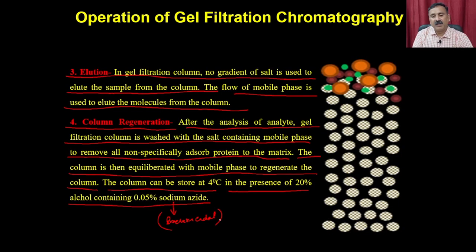So we have prepared a very small demo clip, and in this demo clip we are going to explain how you can pack the column, how you can do the quality checking and all that, and then how you can resolve the proteins and determine the KD values and all that. So in this demo the students have shown you all these operations of gel filtration chromatography.